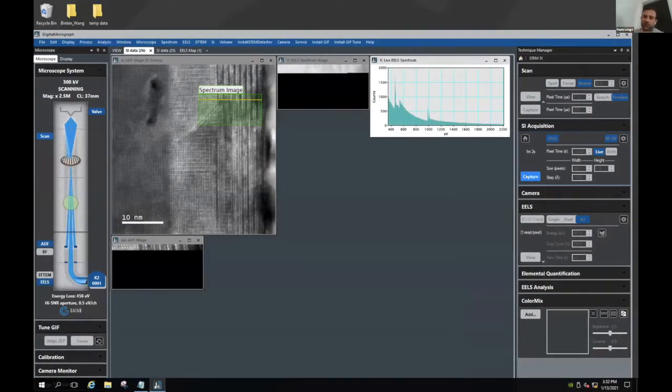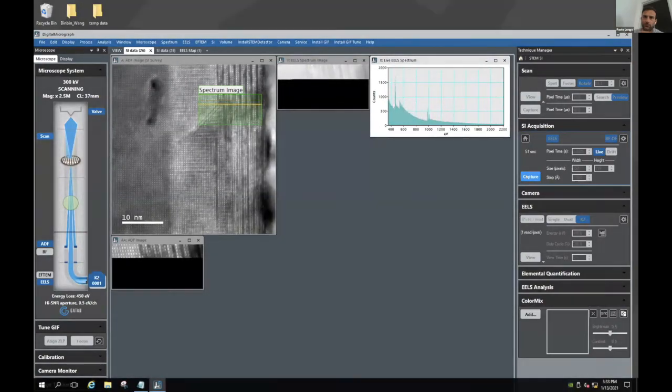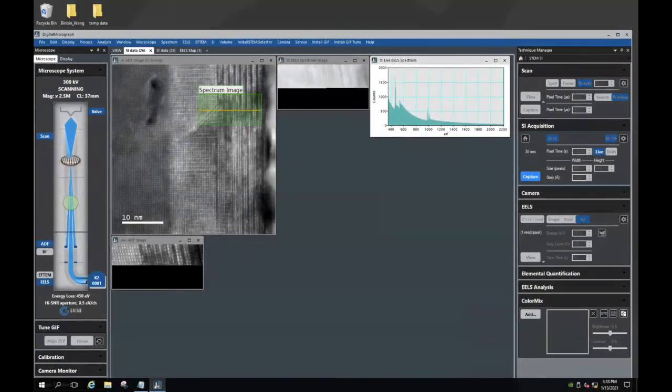So we're going to be switching to the other detector soon. For those of you that might be asking why the sample is drifting or moving at this point: in this microscope we have a mechanical stage, and so we just move the stage around. If you really want the best atomic resolution yields, you would wait probably 5 to 10 minutes after moving the stage, and this drift would subside and your columns would look much more uniform and orthogonal, the way they should for a cubic lattice. Even that being said, this still looks pretty good considering we just moved the stage.